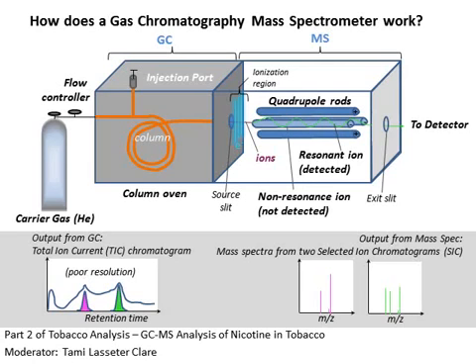Now looking at the output from the GC, ideally we would have a very nice separation of each type of molecule coming off the column, but when dealing with the complicated mixture of polycyclic aromatics found in tobacco extract, in our example, the eluent comes off with poor resolution, which you can see in the total ion current chromatogram. The mass spectrometer is a secondary way to separate out the molecules, which can give a mass spectrum for a particular selected ion from the chromatogram.